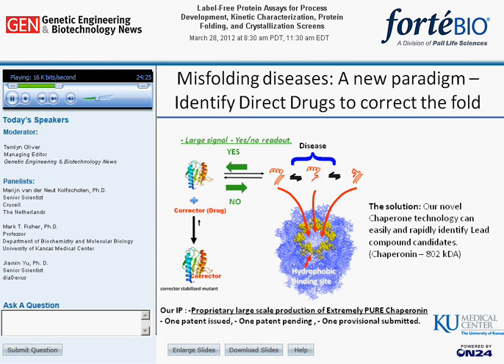For example, if a lead compound candidate does not stabilize the target protein in question, the chaperone will bind to this protein in a time-dependent manner. If a stabilizing ligand is present that binds to the native fold, the chaperone binding reaction will be diminished. It is a simple yes-no decision point.